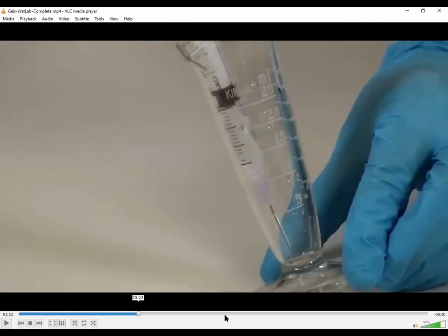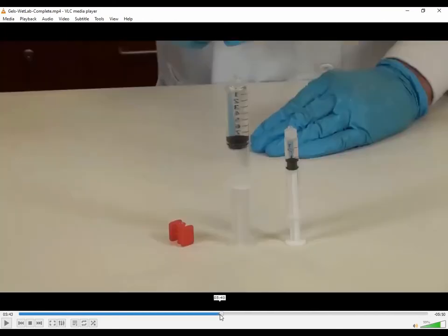So essentially then we're at this stage. You've got all 3 syringes. Where you're going to start is by combining your clear lidocaine solution with the acyclovir with the clear Poloxamer. You see where these are both clear? So how do you put the contents of one syringe into the other? Because you're putting the lidocaine into the Poloxamer.